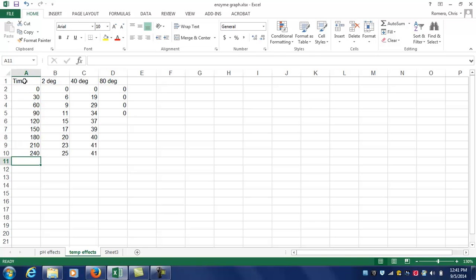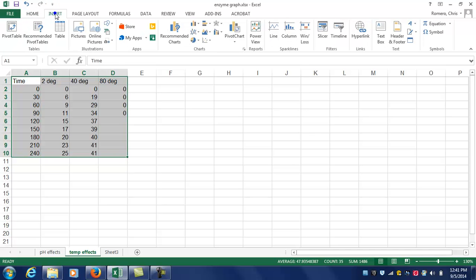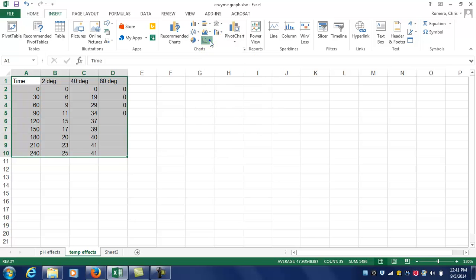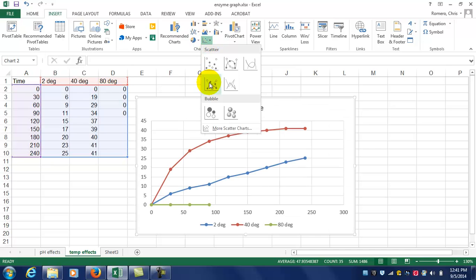First, click and drag and select all of your data. Go up to the menu bar and click Insert. Come over to the Charts section and click on Insert Scatter. Then select the fourth option, which includes the lines.